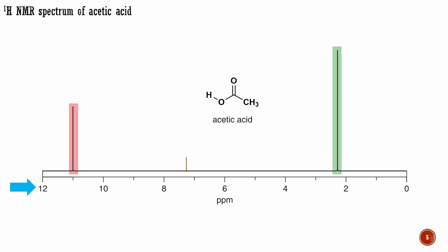This is because the variation in the chemical shift is a measure of the shielding of the nucleus by the electrons around it. There is inevitably less change possible in the distribution of 2 electrons around a hydrogen nucleus than in that of the 8 valence electrons around a carbon nucleus. Note that this 12 ppm scale is not the same as any part of the carbon NMR spectrum. It is at a different frequency altogether. A reminder, ignore the peak at 7.26 shown in brown. This is from the solvent, as I will explain later.